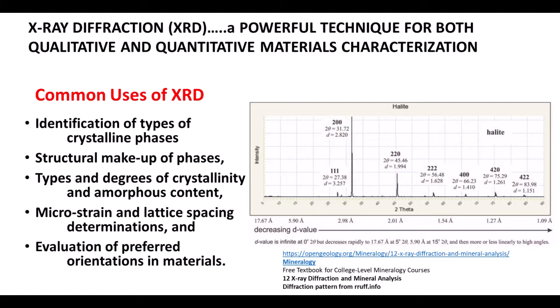We can extend the capabilities of XRD to measuring strains and residual stresses in a material, and it is very useful for accurate lattice spacing determinations in the materials. We can also use it to determine preferred orientations of the crystals within a material, often referred to as crystalline texture.